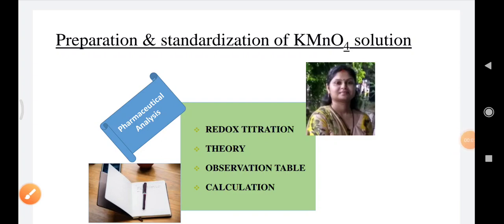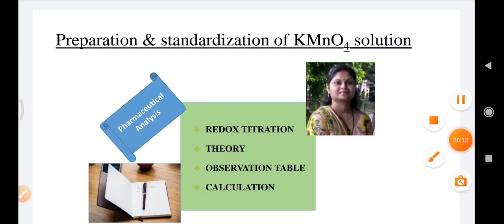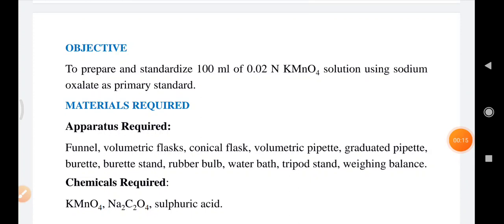Hello everyone. In our practical sessions related to pharmaceutical analysis, today we are going to discuss the preparation and standardization of KMnO4 solution. The objective is to prepare and standardize 100 ml of 0.02 normal KMnO4 solution using sodium oxalate as a primary standard.